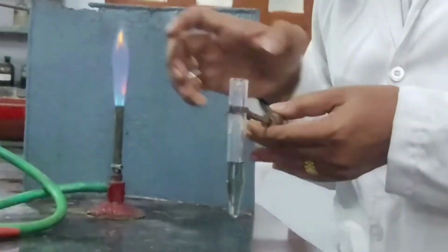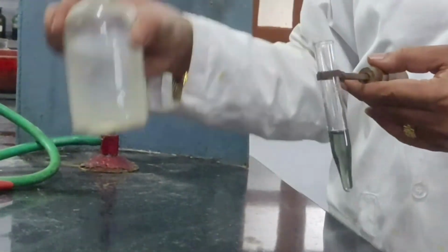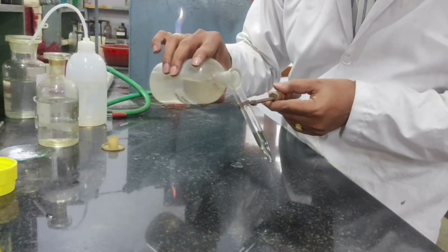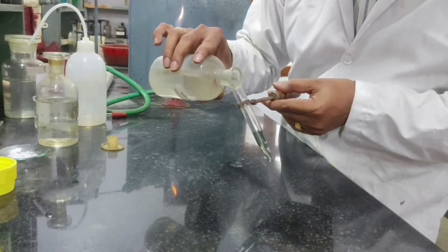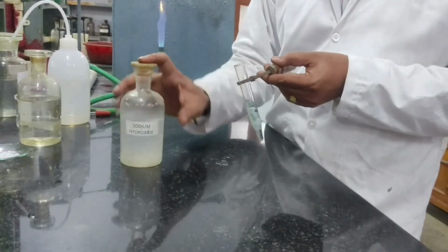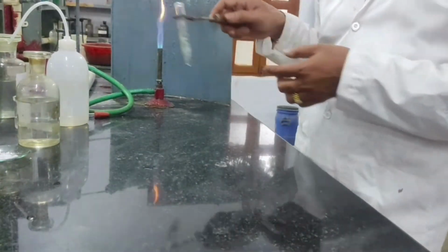Now I am adding few drops of sodium hydroxide to this. See, very few drops. I have added sodium hydroxide few drops and then again I am boiling.